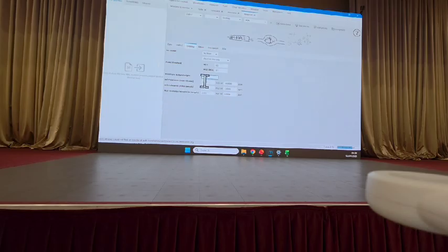So again, you need to check it on your own, and each instrument, depending on if you're using high resolution, medium resolution, or low resolution, will affect these numbers. When you select the presets, it will give you default settings that should match a general instrument. For our purposes, we know that the scan-to-scan tolerance, the intrasample tolerance, and the sample tolerance defaults are working fine.